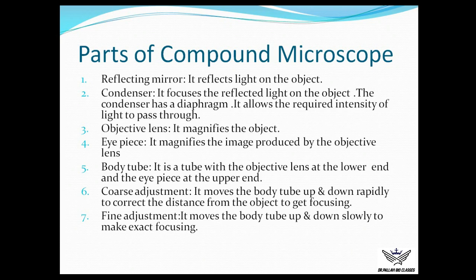Hello students, now in this lecture we are going to study the different parts of compound microscope. In the previous class we have talked about the basic concepts regarding microscopy, and here we are with the parts of compound microscope. Now there are different parts present in the compound microscope. Generally these parts are also present in other light microscopes. As it is one of the light microscopes, we will focus on this light microscope, that is compound microscope.